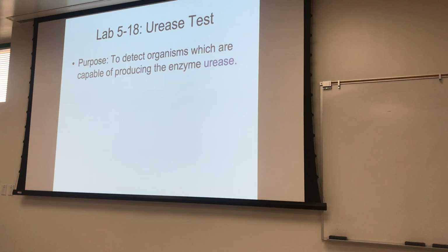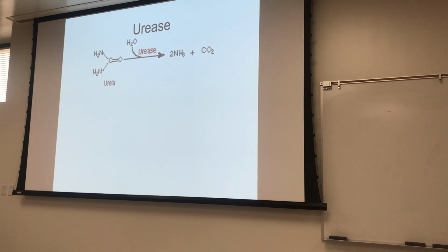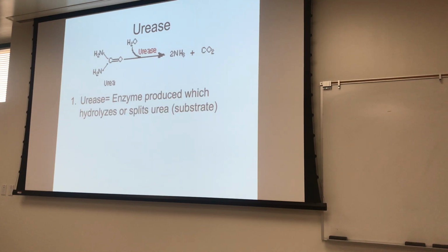There technically is a blood test you can do, which is not as helpful, and then there's another test you can do with stool, yes, but the urease test actually is pretty helpful for diagnosing people, so we're going to mention that. I'll draw this out on the board too, because my image I know is kind of fuzzy, but basically the enzyme that we're going to look for, all it does is split up urea.